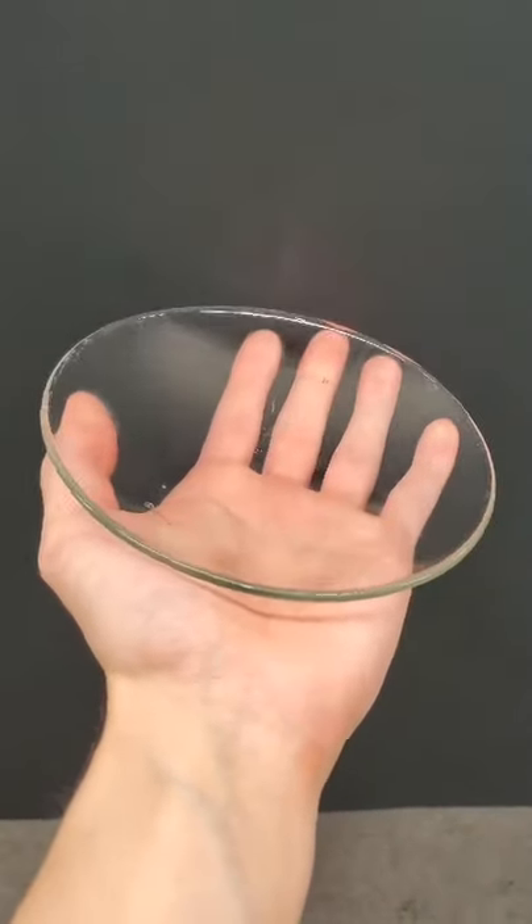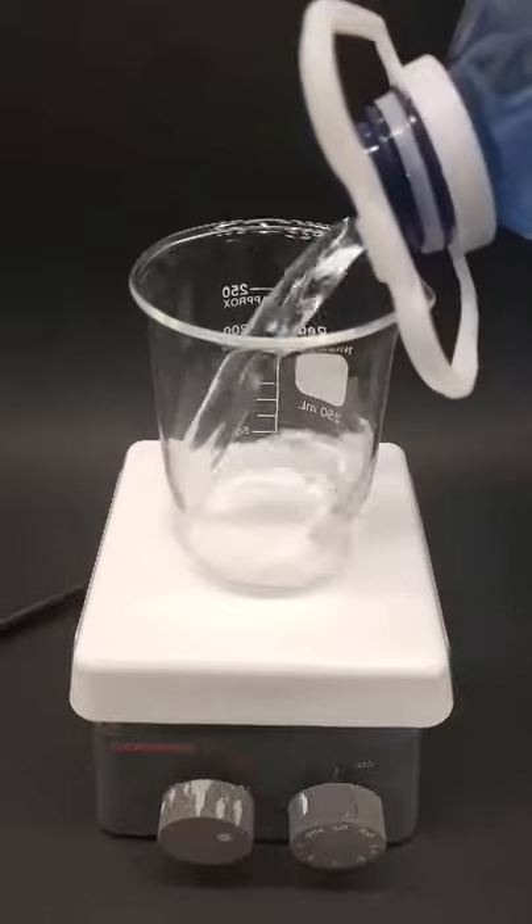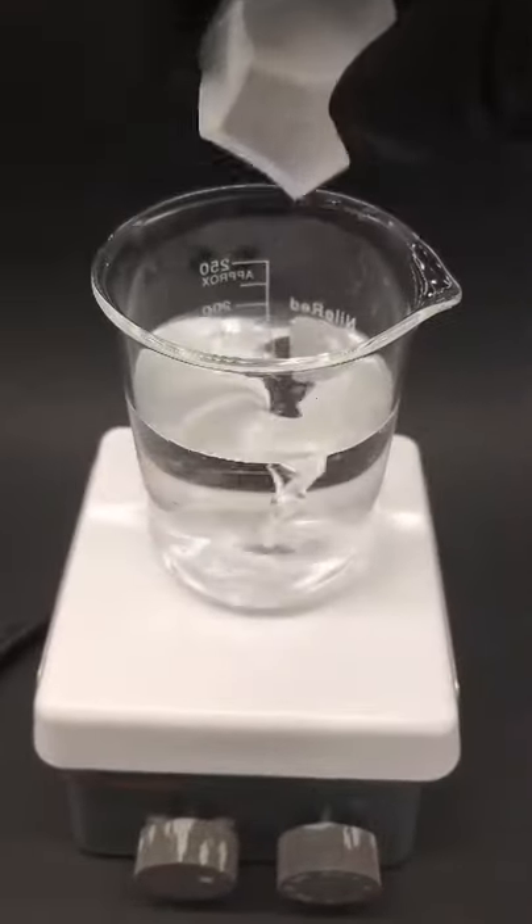So today, I'm going to be turning this dish into a silver mirror using some chemicals. To do this, I just need to add some water to a beaker and dissolve some silver nitrate.